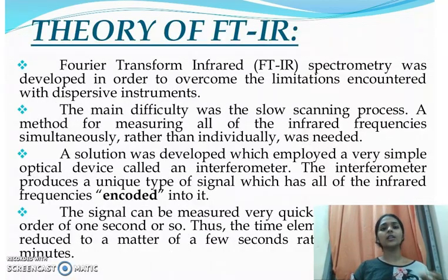Let us now look at the theory of FTIR. FTIR spectroscopy was developed in order to overcome the limitations encountered with dispersive instruments. The main difficulty was the slow scanning process. A method for measuring all of the infrared frequencies simultaneously, rather than individually, was needed.